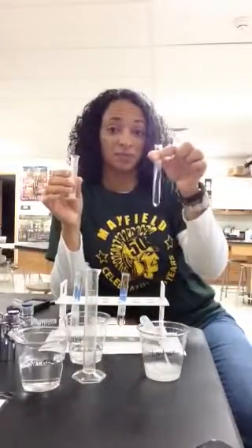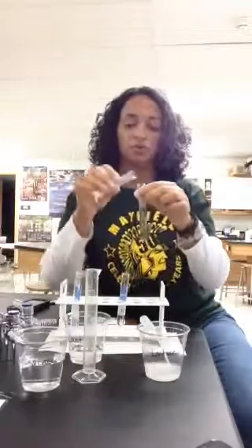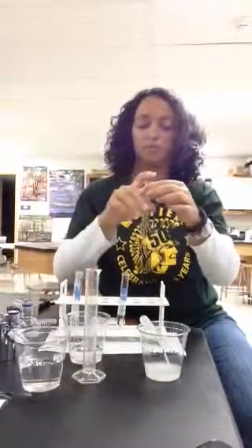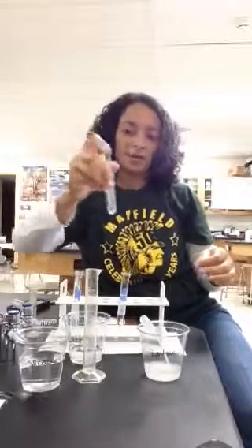This is going to be my experimental test tube. This one is my control. I pour my lactase in here. I'm going to put my finger on it. Shake it vigorously to make sure it's nice and mixed up, and then I'm going to let it sit. I'm going to set the timer on my phone to let these sit for 3 minutes.